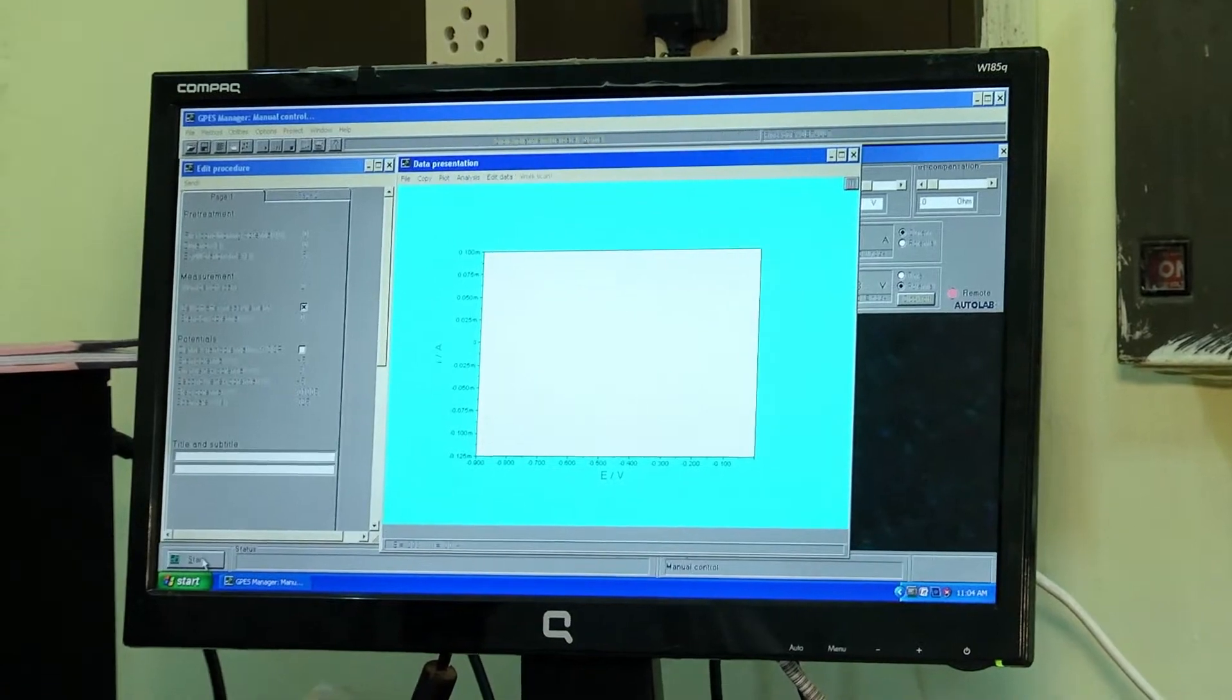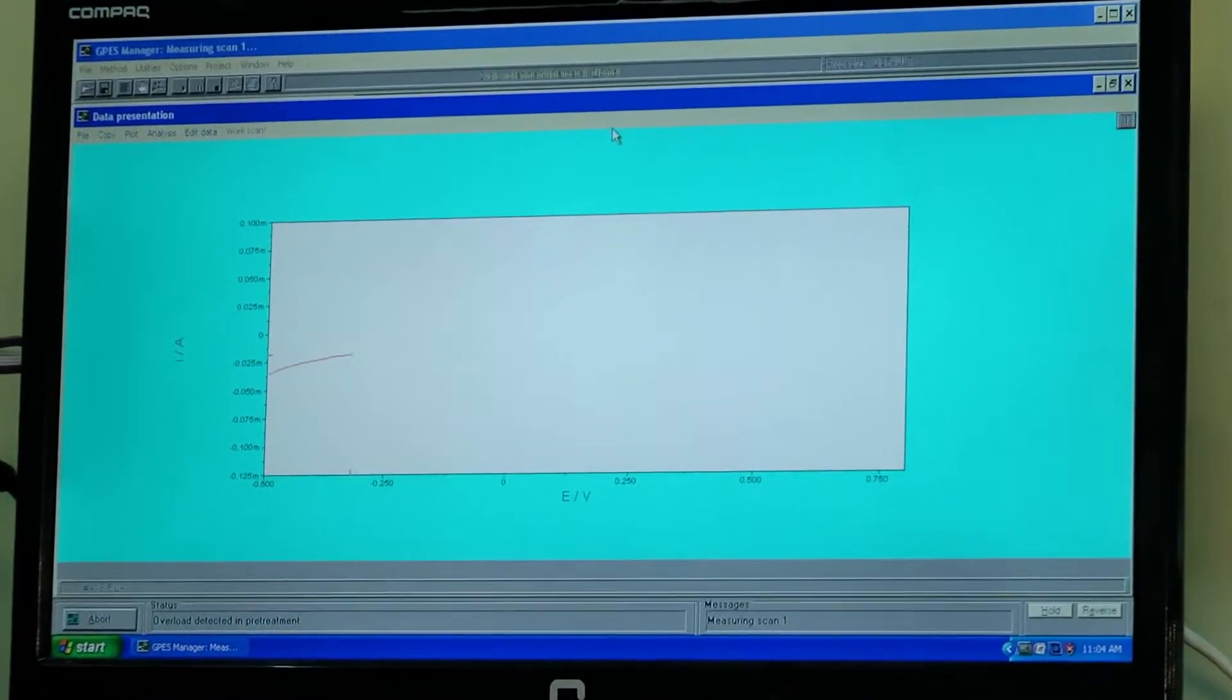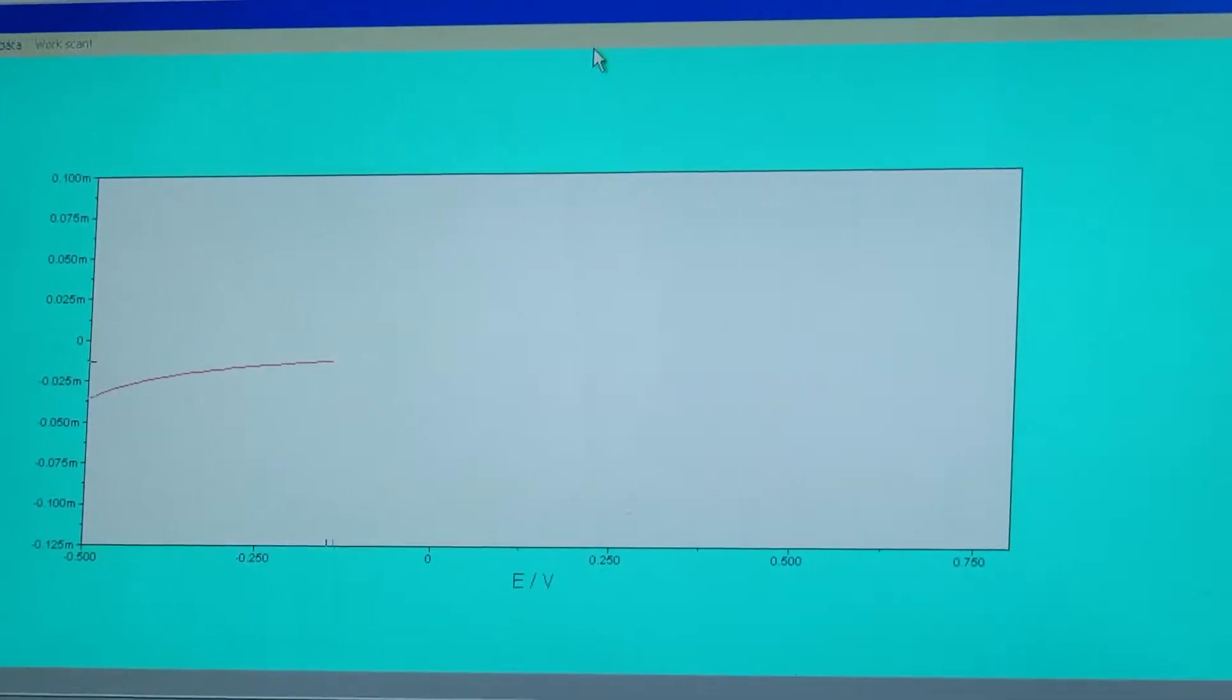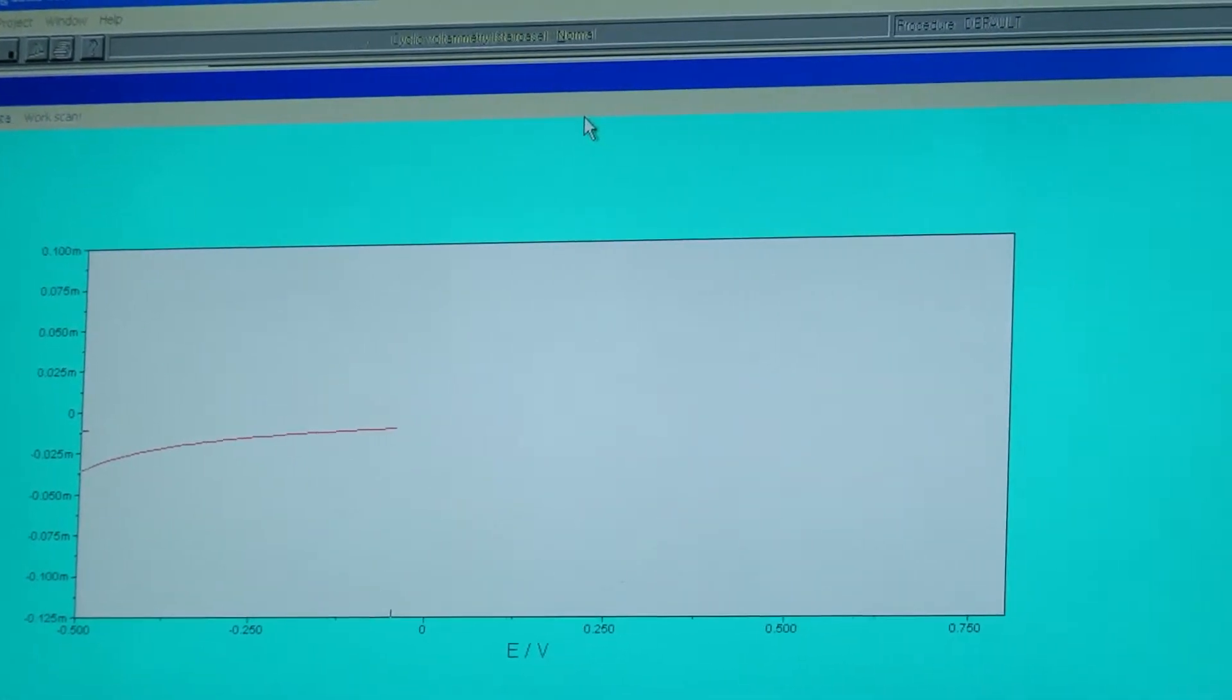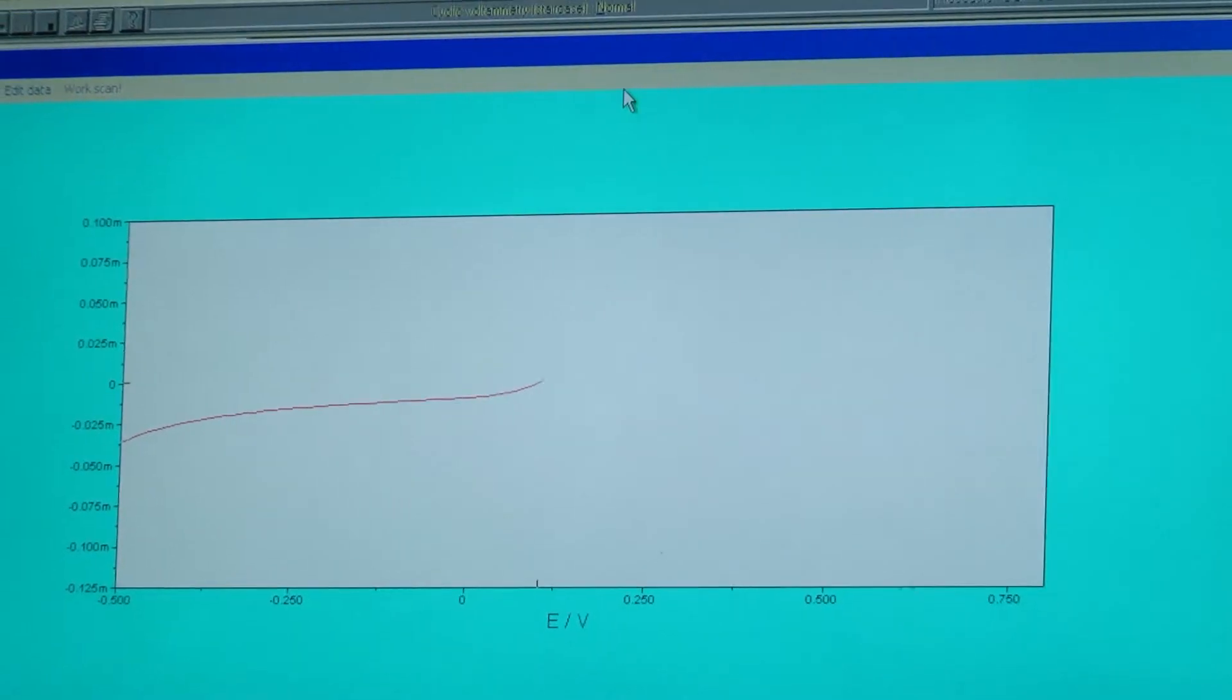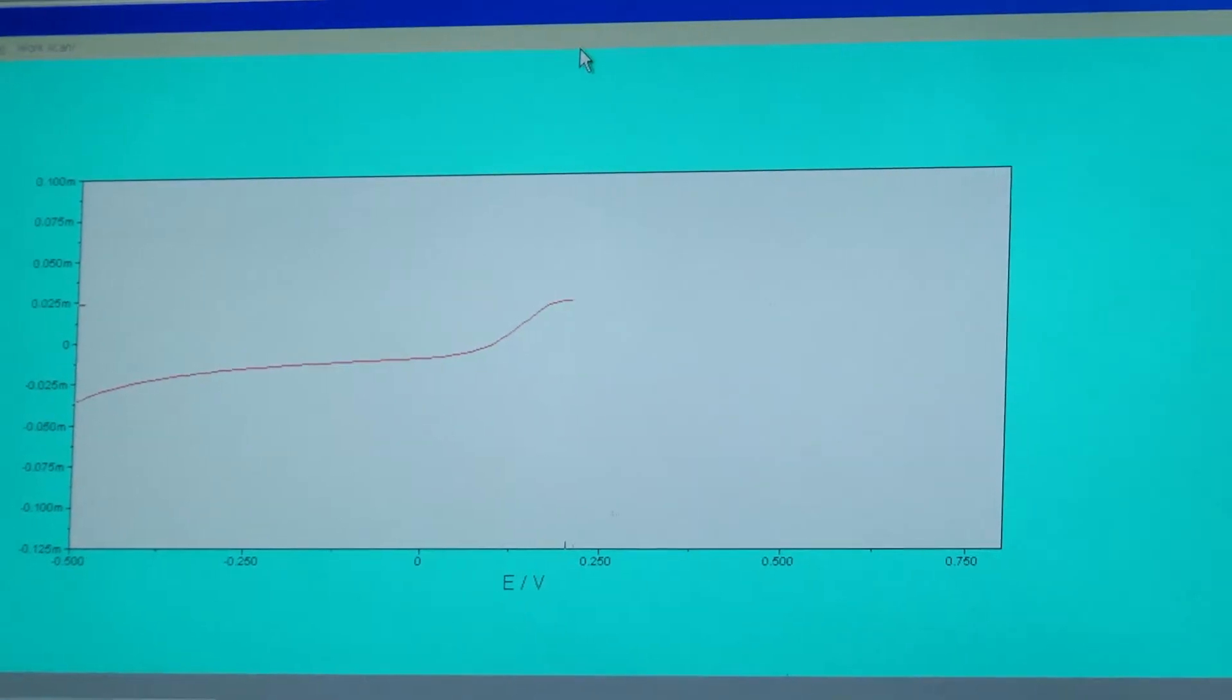A pre-programmed GPES software is used for this study. As you can see, initially it starts with a non-faradic background current, and then after 0.1 volt the current starts to increase due to the redox reaction.